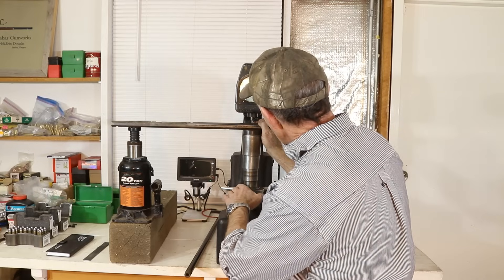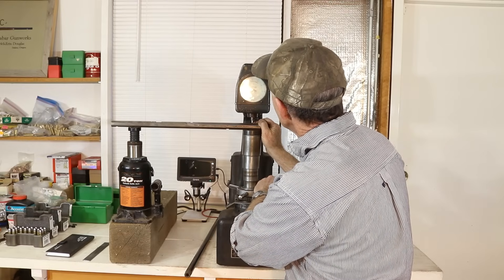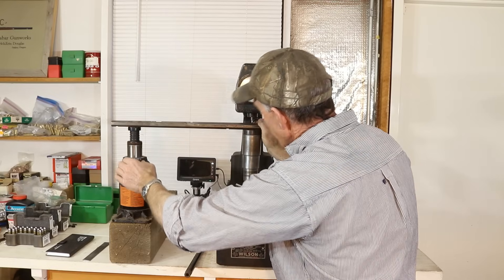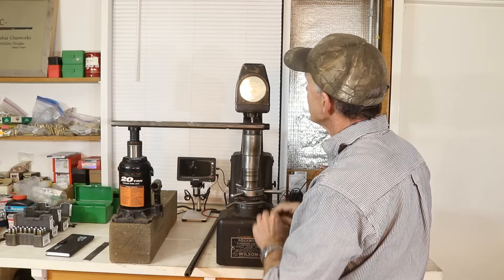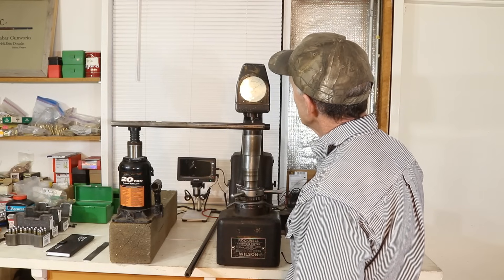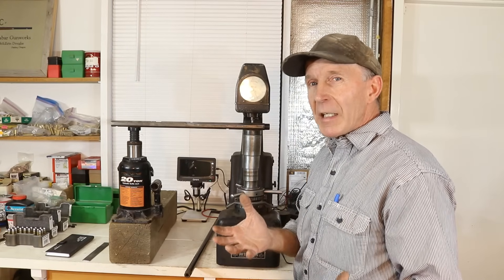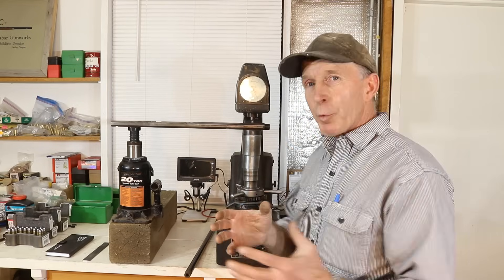We slowly introduce the preload, take the weight off, and the preload stayed about the same. Our expectation is to be somewhere in the high 70s, where our mild steel test piece was. She stopped moving — we're at 73. So if 1018 was 71, this is a very similar hardness to 1018 mild steel, which is exactly what we've always talked about with these early barrels.